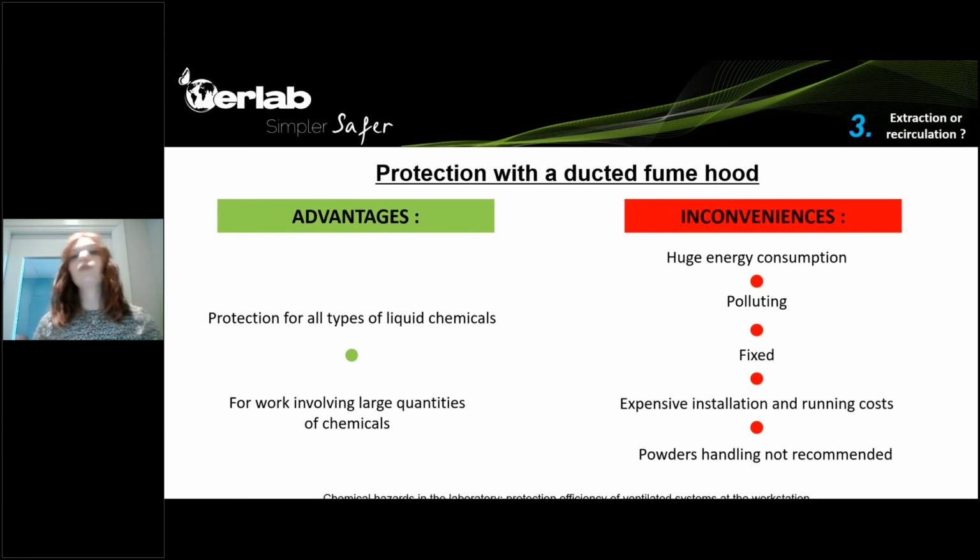The inconveniences are the huge energy consumption, and the fact that it's polluting the air, because the toxics are just released into the air right after being extracted. It is fixed to the exhaust system, so it is not possible to relocate it easily.